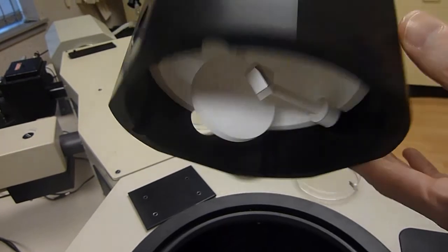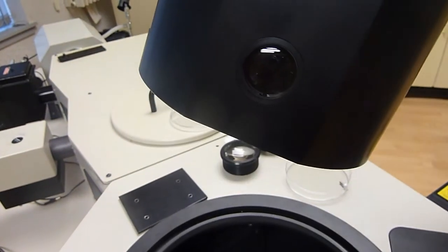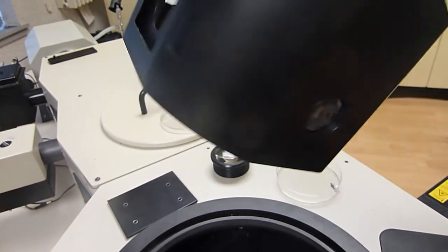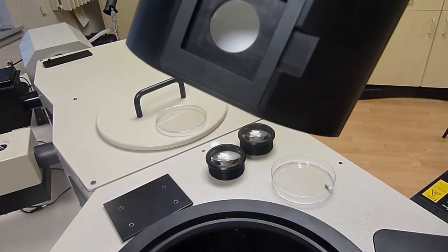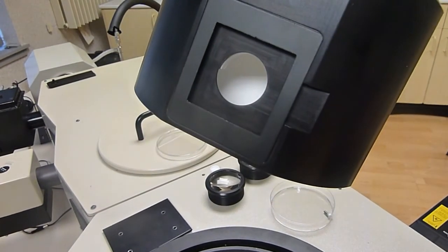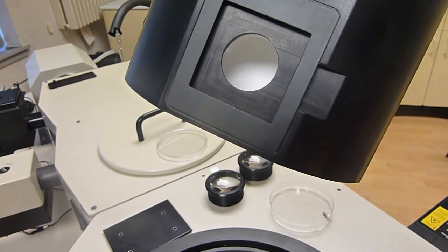Another little thing to perhaps point out is that we have a lens for the excitation for good focusing. But we do not have a lens for the emission side because we don't want to lose any signal from reflections.